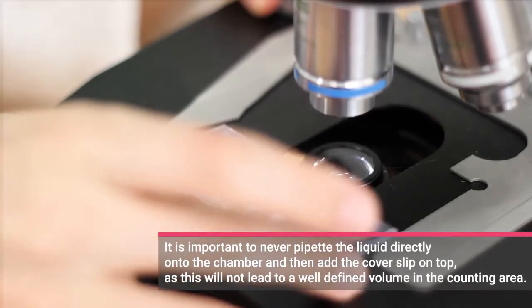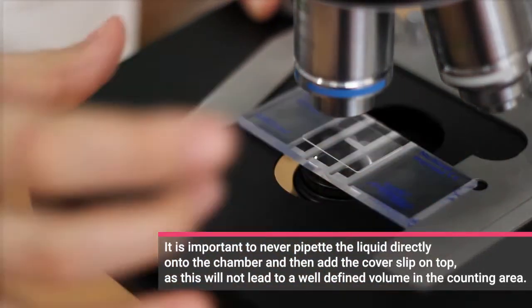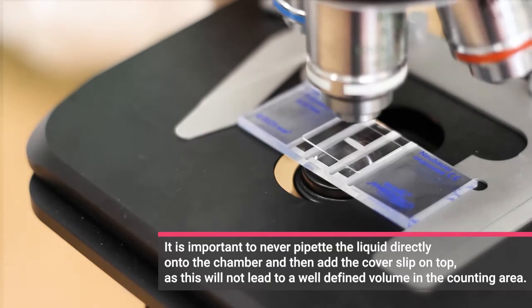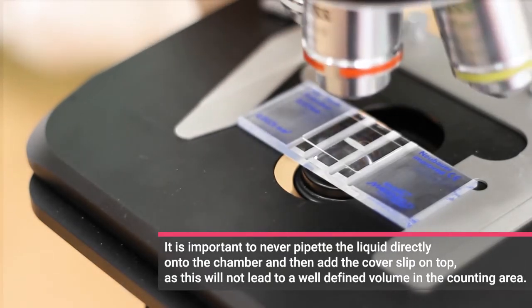Place the chamber under the microscope and choose a low magnification. Focus on the quadratic structure called counting grid and see if the cells are spread equally. Now choose a proper magnification and use phase contrast to see the counting grid in more detail.